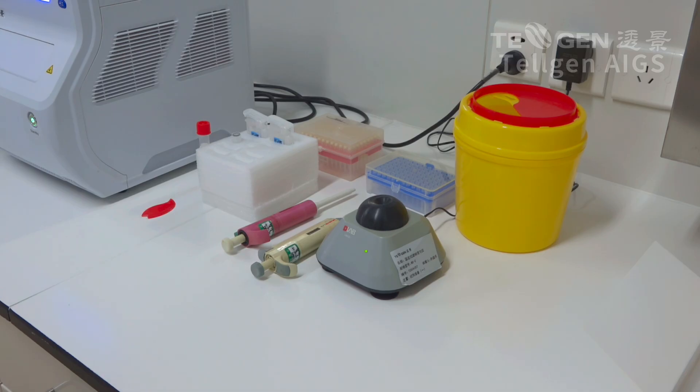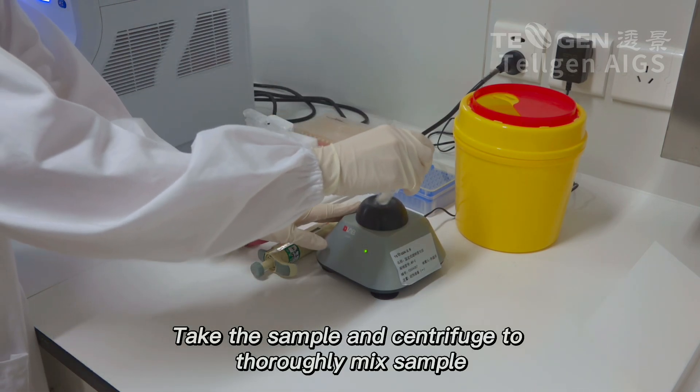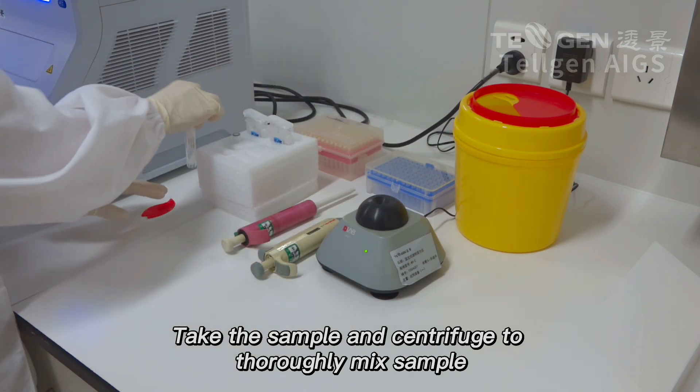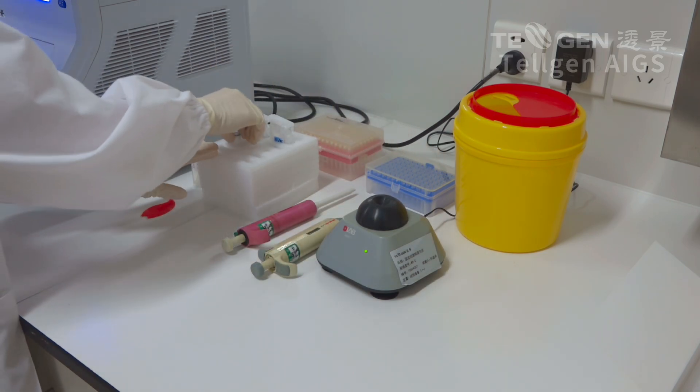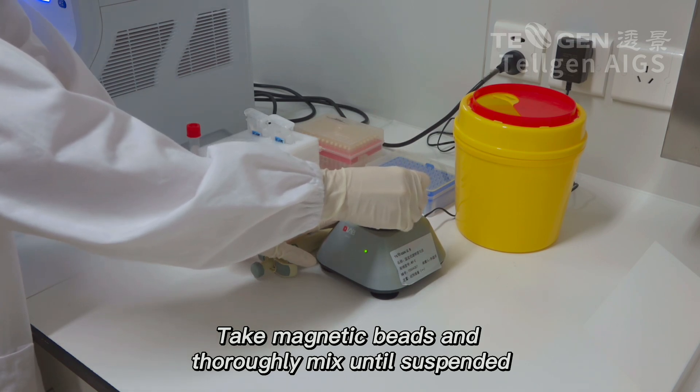Experimental Preparation. Take the sample and centrifuge to thoroughly mix sample. Take magnetic beads and thoroughly mix until suspended.